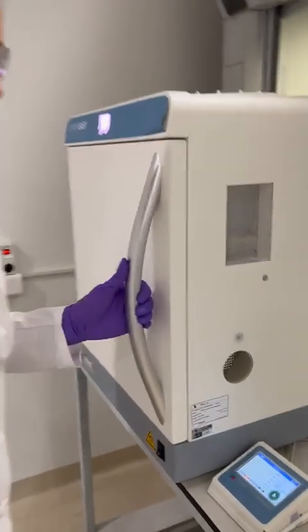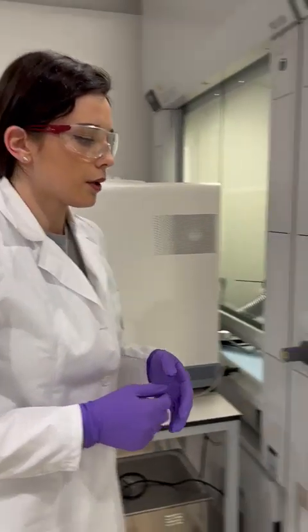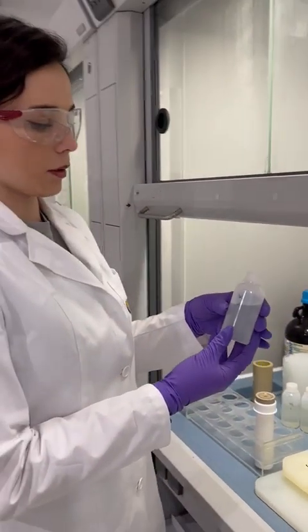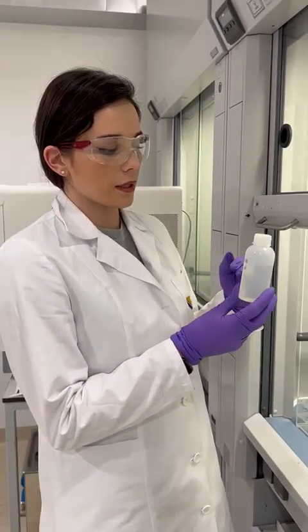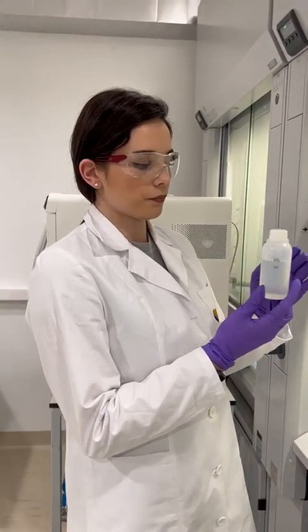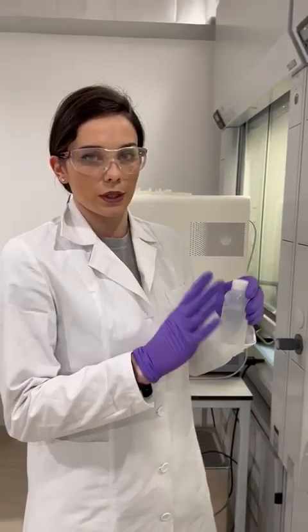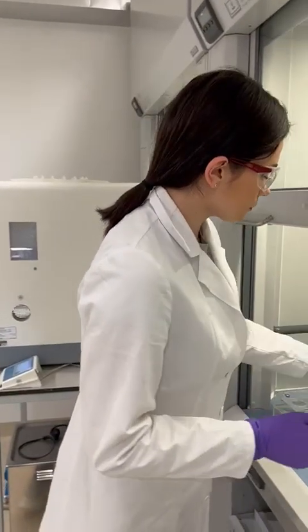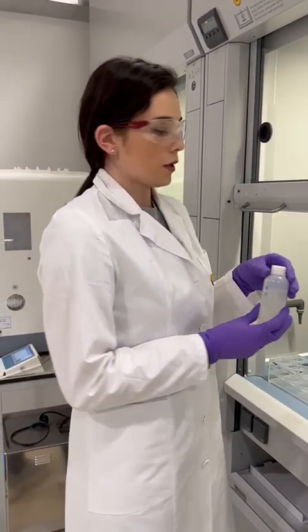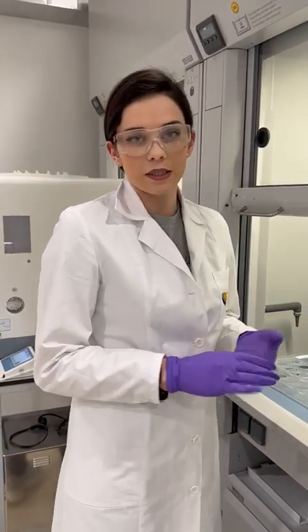The digestion is approximately 40 minutes long. After that, we are quantitatively transferring our samples into plastic bottles, as you can see here, and we are adding 2% nitric acid to the mark of 100 milliliters. Everything is done gravimetrically, so we are doing everything by mass. After this, our samples are also gravimetrically diluted according to which element we are analyzing. The dilution step you will see in our video too.